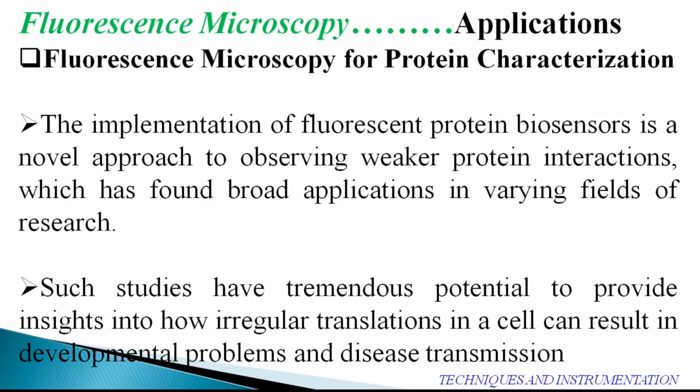If a sample from a patient having developmental disorders, or showing certain disease symptoms, undergoes protein analysis at a specific target level using fluorescent microscopy, and you notice that some abnormal protein has been synthesized, that would be a diagnostic tool, or diagnostic test, you can call it, for such protein use in patients.